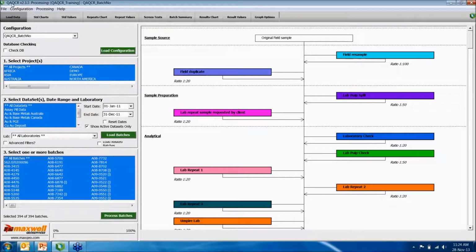The third one is the QAQCR version number is included on the main window and error windows to reduce the need to supply the QAQCR version number when requesting assistance. So you can just reply and you don't need to provide the version number. It's included in every page.